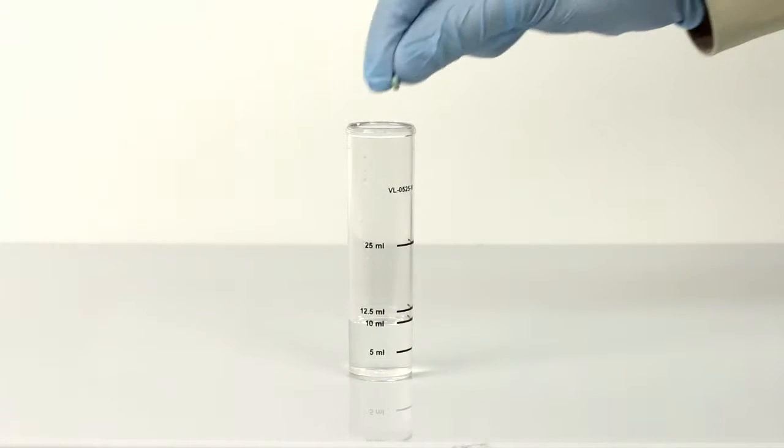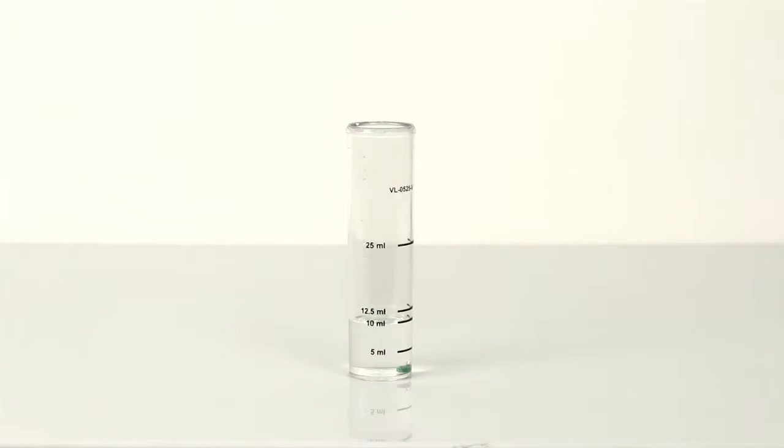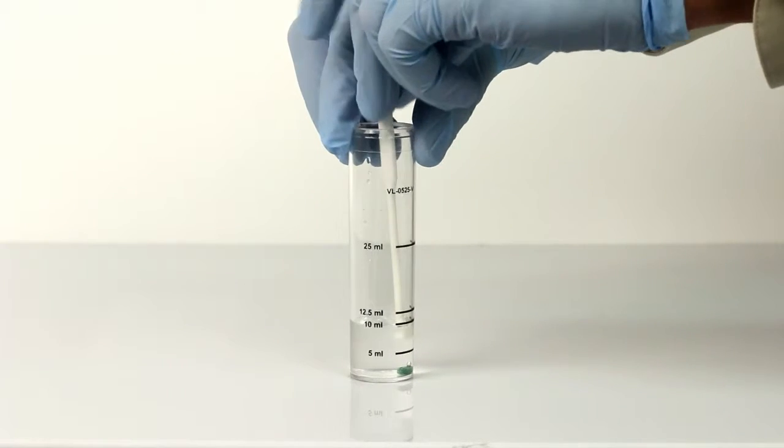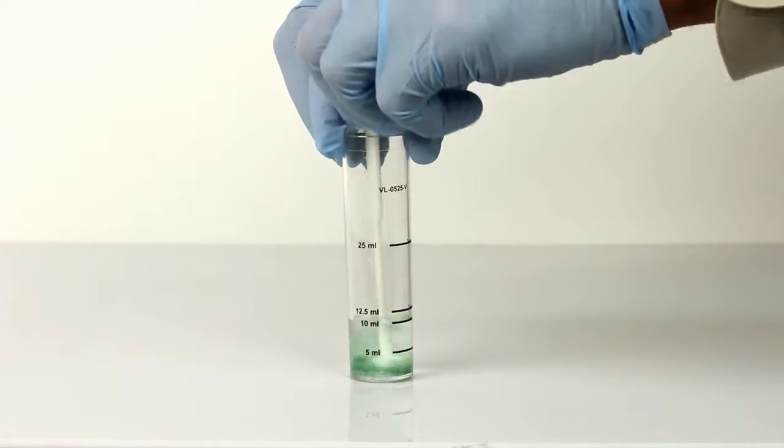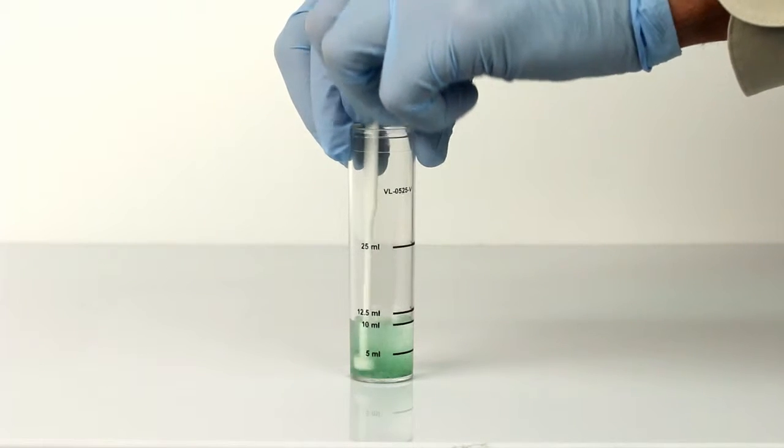The next step is to add one OP tablet. After you add the tablet to your sample, use the Tablet Crusher to help dissolve the tablet. Swirl the vial to mix. A green color will develop.